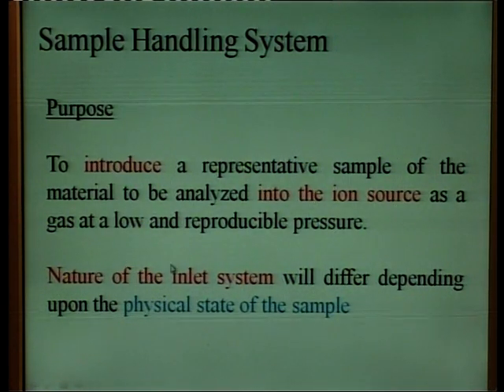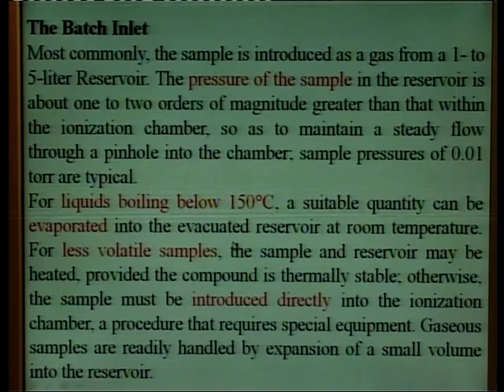The sample handling system, the purpose behind this is to introduce a representative sample of a material into the ion source as a gas. The solid cannot be introduced, it should be in a volatilized form and under a low and reproducible pressure. The nature of the inlet system is dependent upon the physical state of the sample.